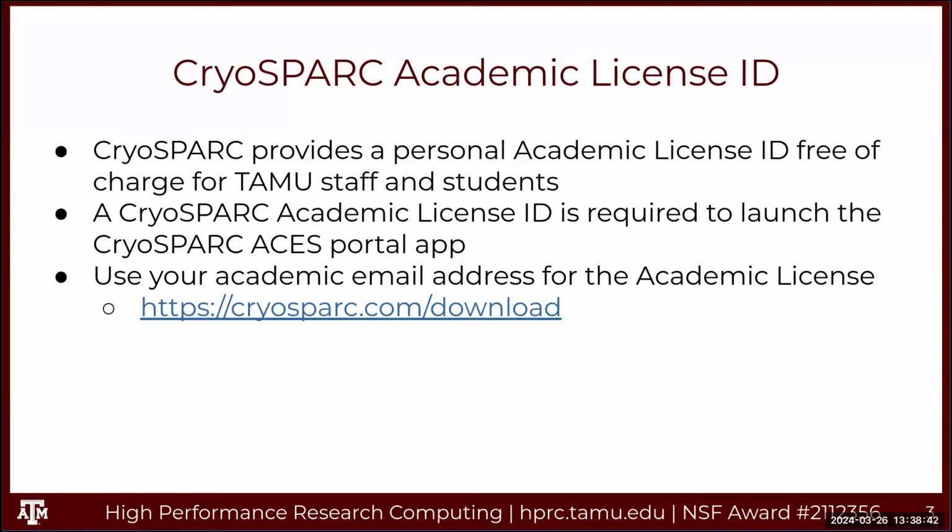So you can get a CryoSPARC license free of charge. It takes about a day to get a response, and it would be good to use your academic email, since this is an academic license, and you'll need this license each time you launch CryoSPARC. You can only launch one CryoSPARC session at a time, and we'll go over that. Here's the website where you can download the academic license if you haven't already. This course is being recorded, so you can watch it later on our YouTube channel. If you don't have an academic license right now, you can follow along later after the recording is posted.